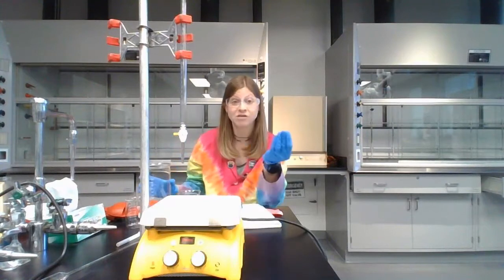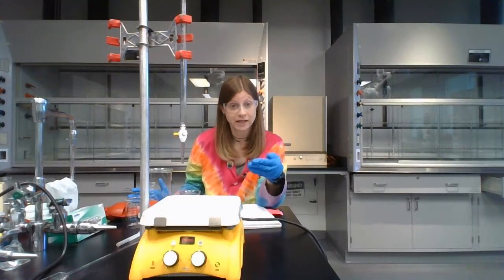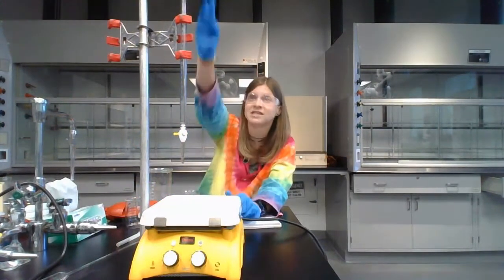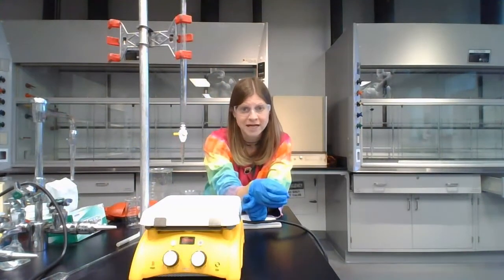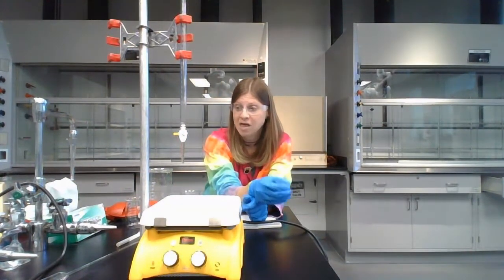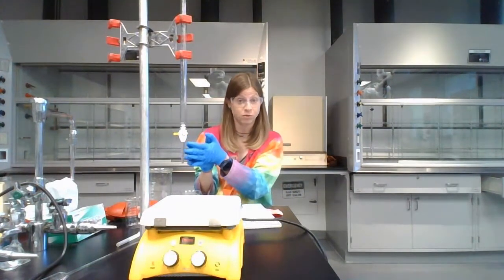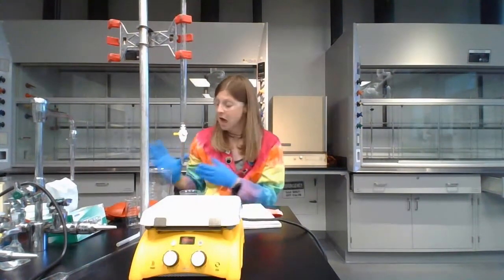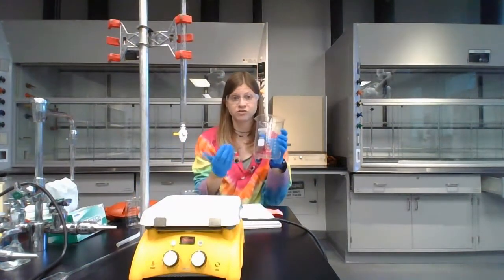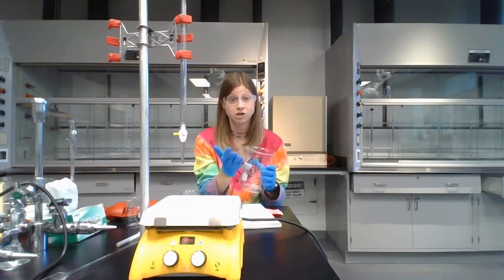At the end of the lab, you need to consolidate all of your purple potassium permanganate, so the pure purple potassium permanganate that didn't touch anything else, like anything that's left in the burette, anything that's left in the beaker of the pure purple potassium permanganate, and then anything left in your waste beaker that had already been there. So you're going to have all your pure purple stuff in one spot, in a small, like 250 milliliter beaker. And then you're going to have your 1 liter beaker that's filled with all of your reaction mixtures at the end of your titration.